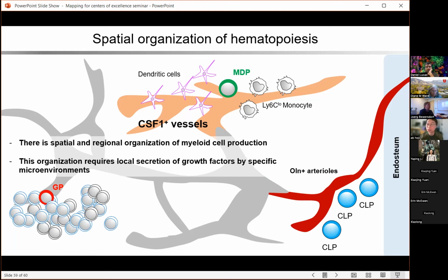I've never seen so many hematopoietic stem cells in that small section. I looked at the tibia, and we don't normally see the stem cells at all. Well, stem cells in the sternum are very few. There are between 5 and 10 per section, which is what you expect, because we are getting 50,000 cells in one of these thick optical sections. You see a lot of progenitors because we are imaging essentially every progenitor in the marrow. So they are more abundant, and then there are many more types.